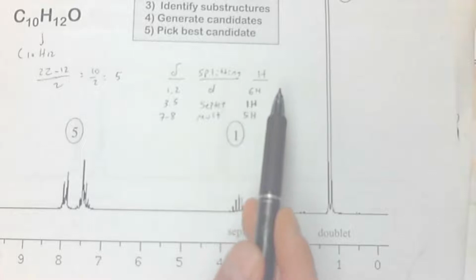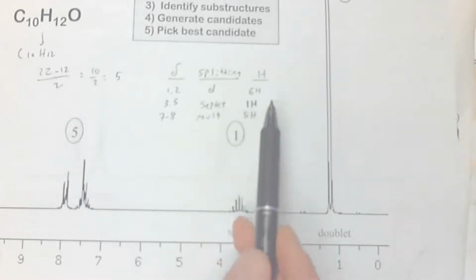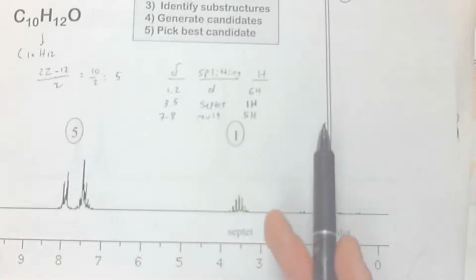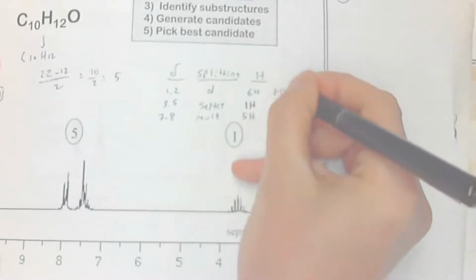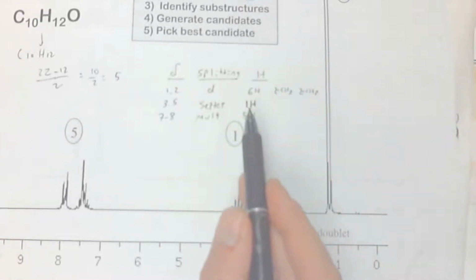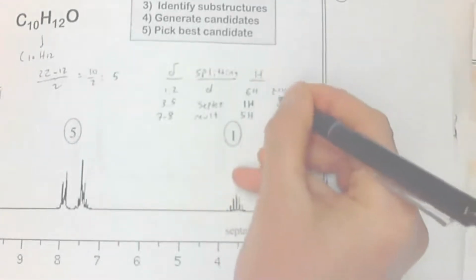Let's make the substructures. We'll do the easy ones and then the slightly more confusing one. So 6H, we did that last problem with 6H, around 1 ppm. Same thing as before. 6H, 3H, 2 methyls. Okay. Single CH, probably a single H is probably a CH, right?